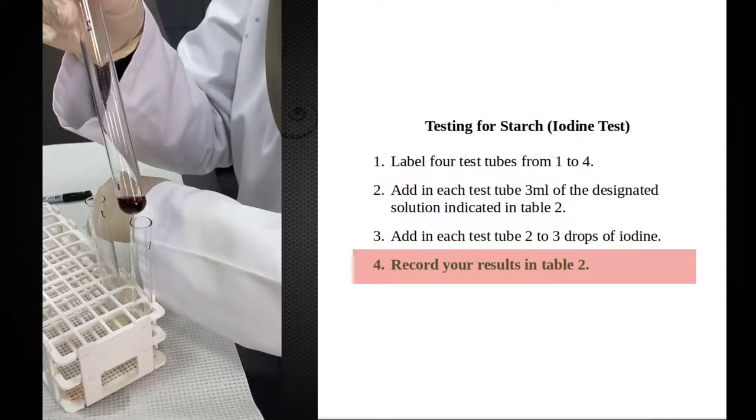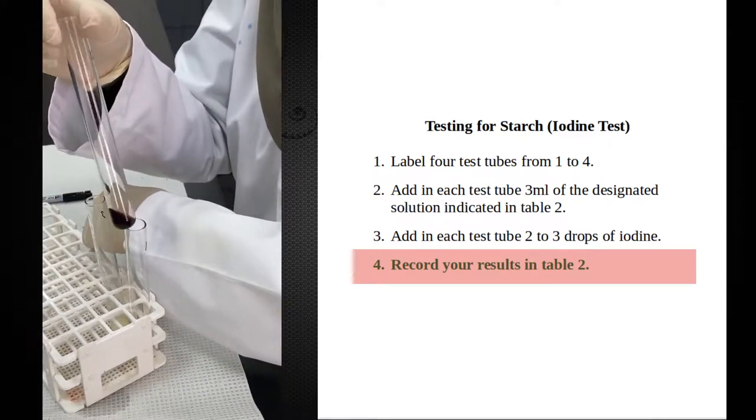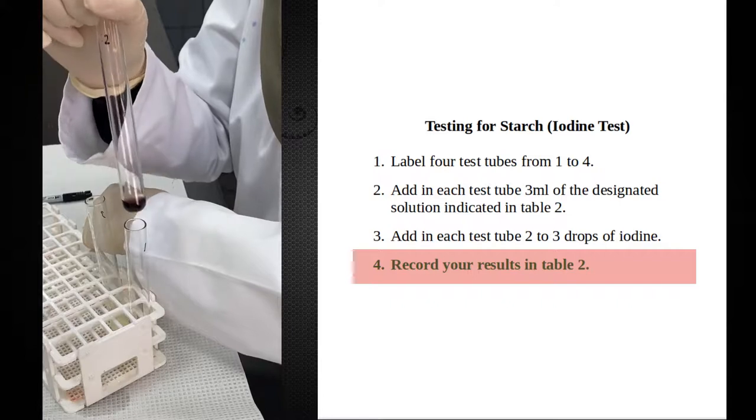This is the color of my starch solution, dark purple, or dark blue color. This is my positive control.